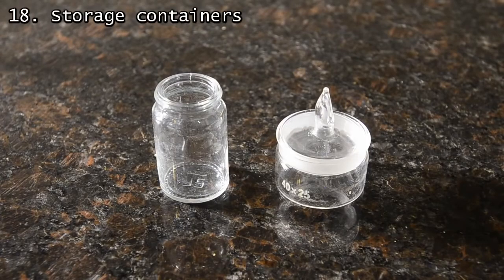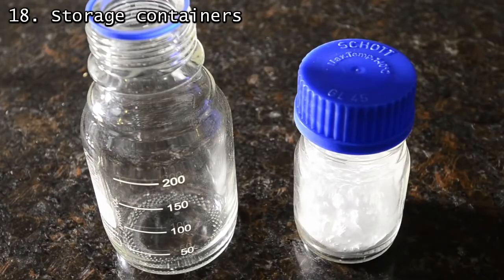Once you've filtered, you'll want to store your product. We've got a couple of fancy ground glass weighing containers, but mostly we just use small glass jars like the one on the left. Liquids are trickier, especially reactive or highly volatile ones.